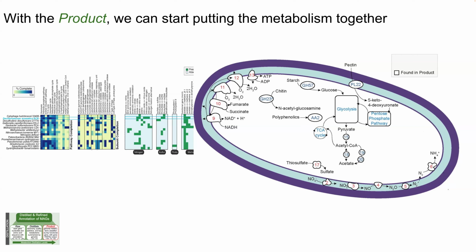And so really these are lowering our false positives for calling these genes on larger carbon. And so we spent a lot of time there, and that is an add-on of DRAM that other annotation tools don't have.